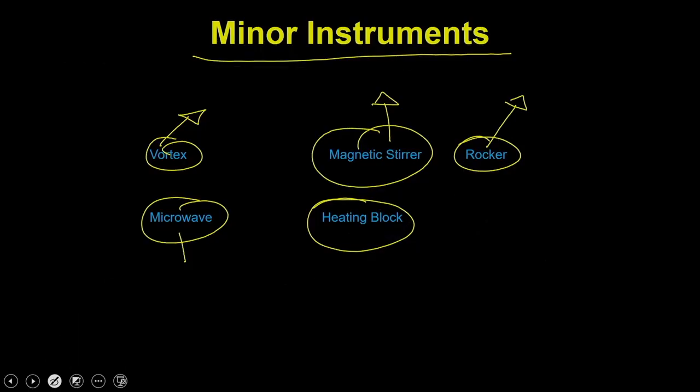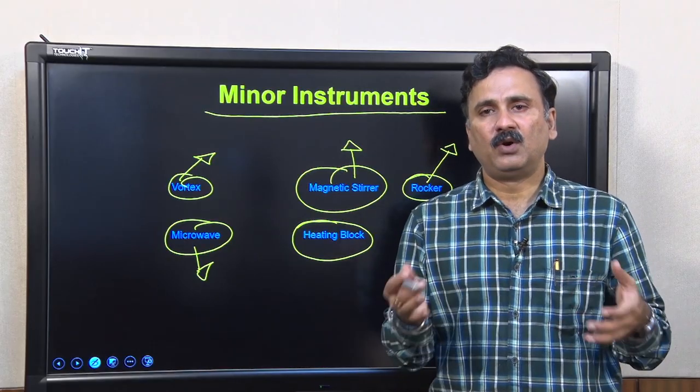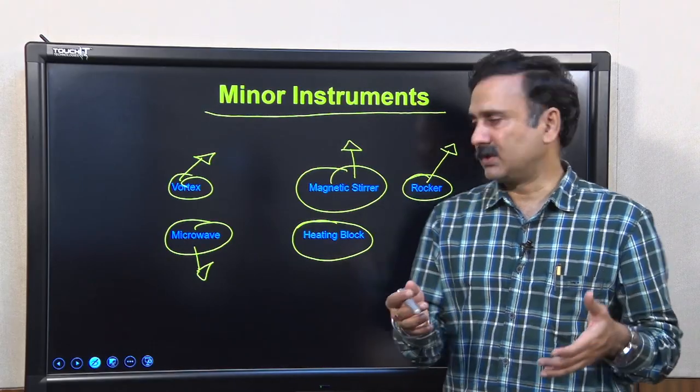Similarly, you require the microwave in case you want to heat up samples, like if you want to prepare agarose gels or any other kind of preparation, or you want to make LB agar and all those kinds of things.